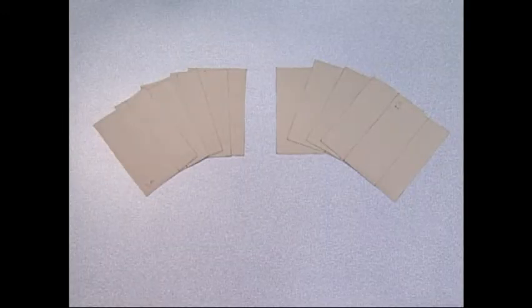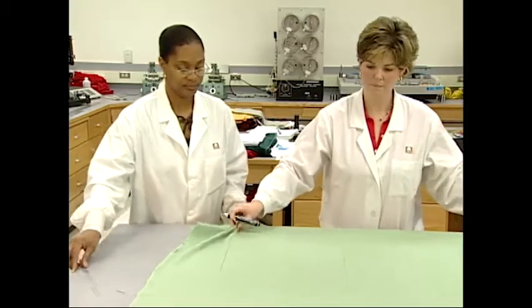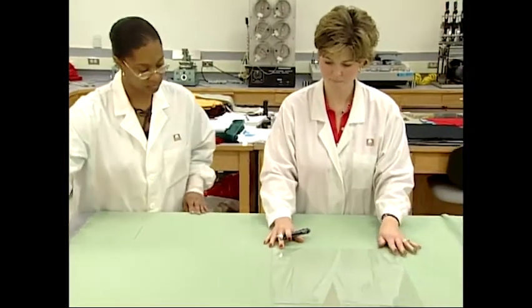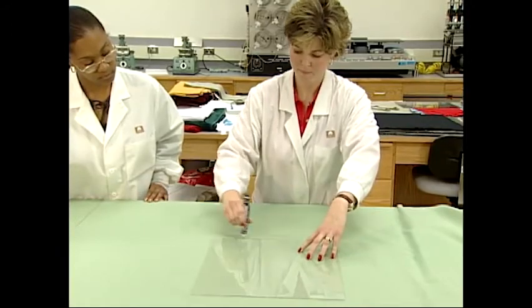Because fabrics are two-dimensional in their construction, many procedures require the testing of two sets of specimens. For woven fabric, one direction reflects the length or warp. The other direction represents the width or filling. The actual location of the specimens removed from the fabric is very important. Every effort should be given to prevent testing of the same yarns in the fabric.